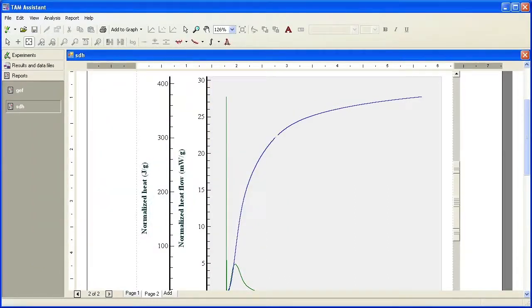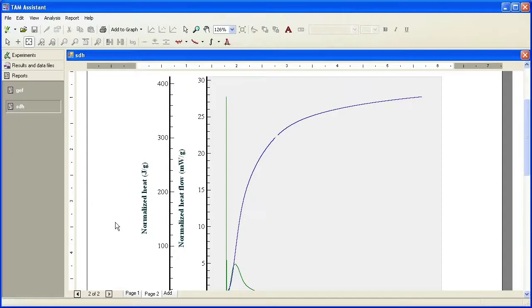So here's a couple ways that you can create a report or an overlay in TAM Assistant software.